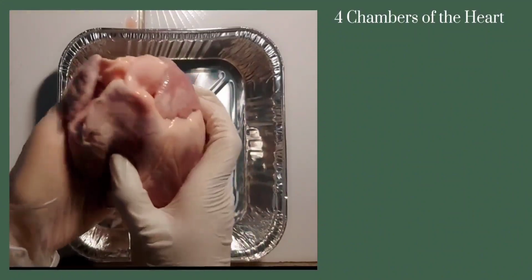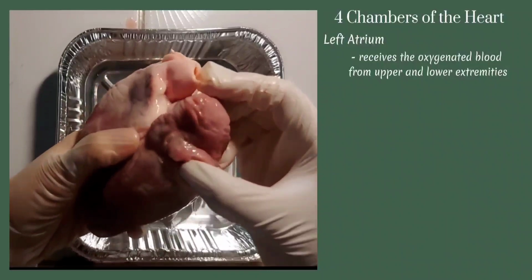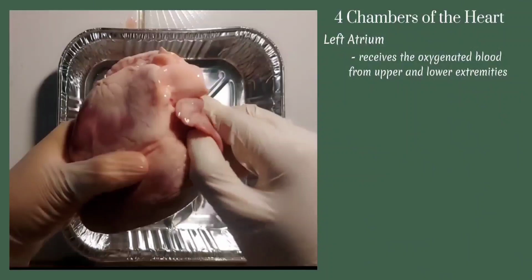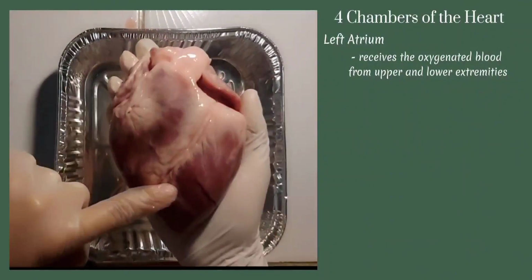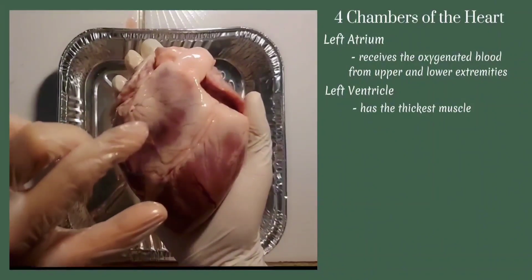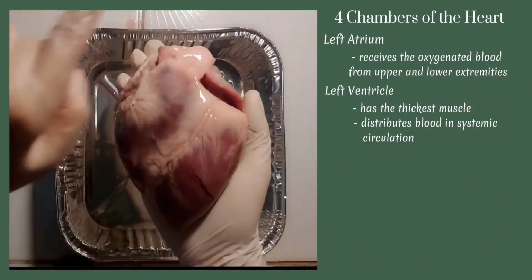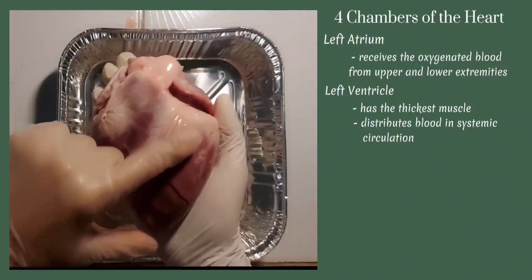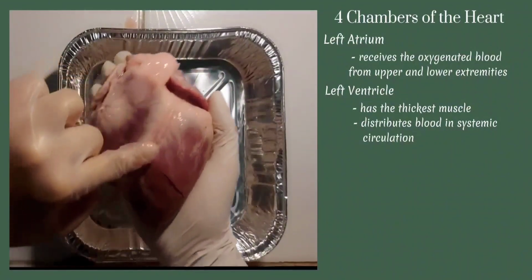This part right here is the left atrium. This part is the one who receives the oxygenated blood from the upper and lower extremities. Remember that the left side of the heart receives the oxygenated blood and the right side of the heart receives the unoxygenated blood. And just below the left atrium is the left ventricle. We'll see later that this has the thickest muscle out of all the four chambers because its function is to distribute the blood to the systemic circulation, which requires a lot of work, therefore requires a bigger muscle. This left ventricle is the largest out of four chambers.